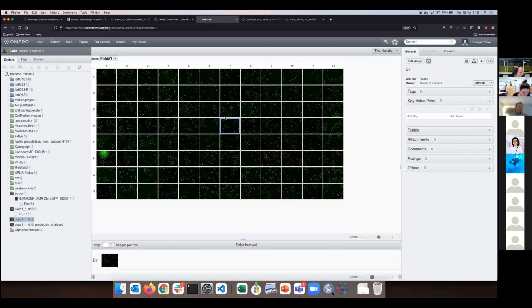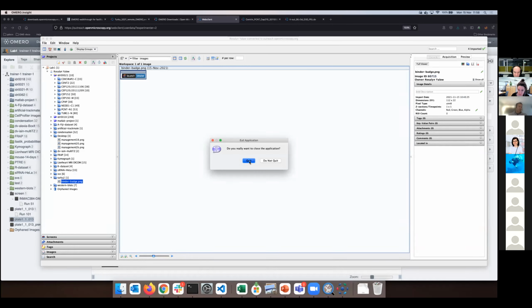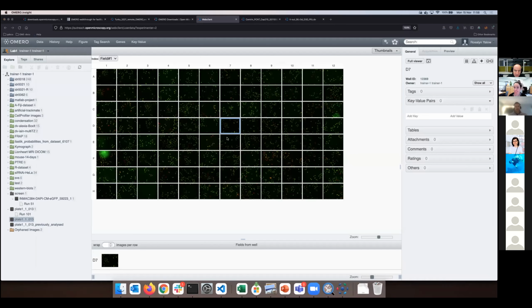And one thing that probably Peter didn't have time to present, even when you import the data, you can do plenty of operations on behalf of somebody else. So if I analyze your data, I will analyze it for you, but you end up being the owner of the output of the analysis. So then after you can delete them and do whatever you want. So we can allow this type of permission. It just boils down to how you want to collaborate with a group of people. Yes, indeed. Thank you. That's all very important.